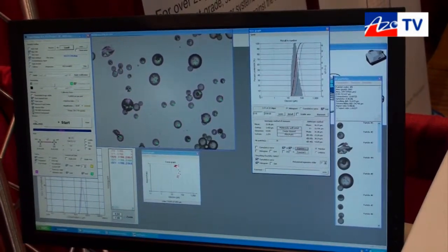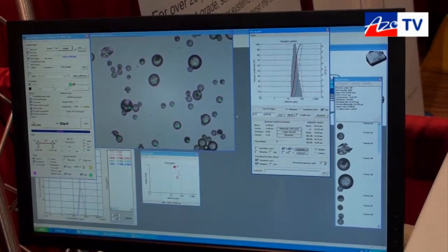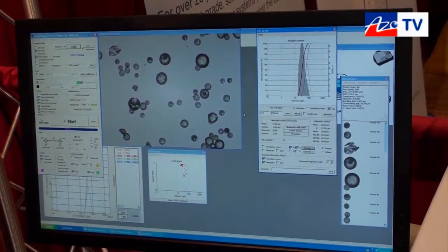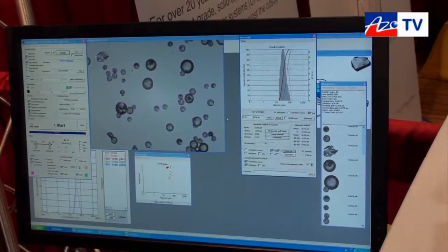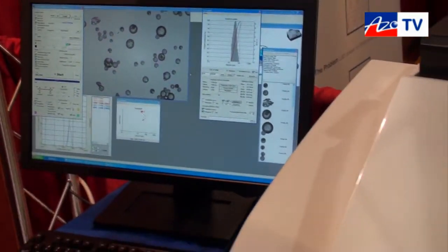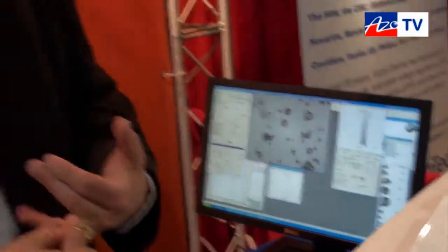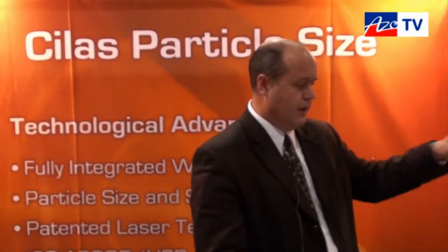So as you can see we have a full featured particle size analysis system using laser diffraction which CELAS invented in 1967. We have a three laser system and lasers are used only because they are the most precise and have the highest accuracy of any other type of light source for laser diffraction. We have integrated liquid and dry dispersion with integrated shape analysis, so we have a full featured particle characterization analyzer.